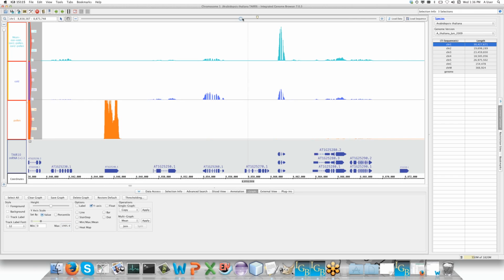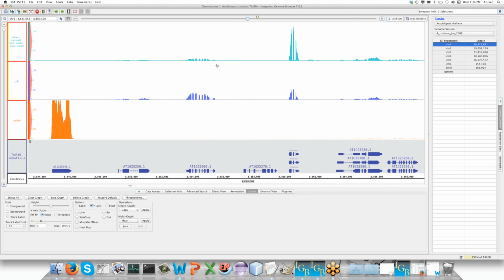Well, that's nice, that's convenient, but what next? Well, now I am going to select mean first, and then I'm going to select cold second. And I'm going to ask for a difference. In other words, subtract the cold from the average and show me what that looks like.